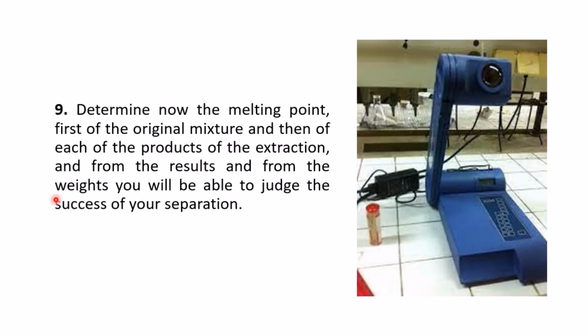Of course, you are going to weigh every product you get from the liquid extraction or solvent extraction method, and then you determine their melting points, and compare that melting point value with the known compounds as to whether you were able to successfully extract the organic compound from the mixture.